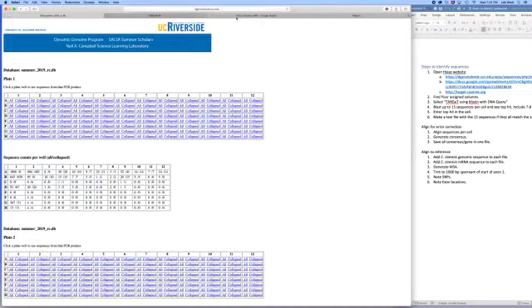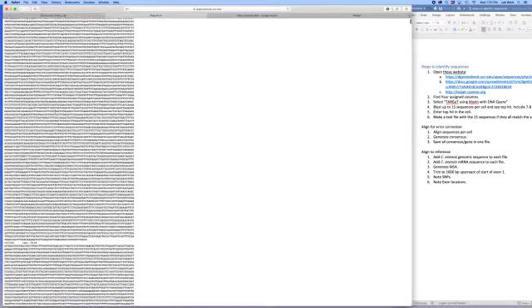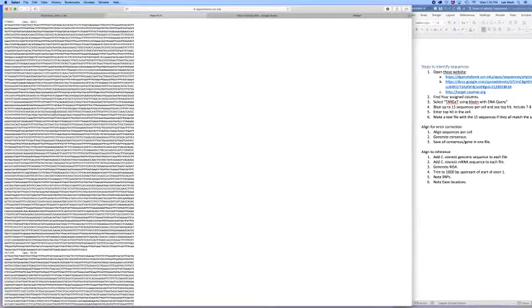But the problem is, I noticed as I was verifying my analysis, my cleaning up of the sequence, all the different scripts that I run the sequence through to get it so that it's usable, that when I searched on these sequences, so if I click this, I will get it in this tab here, when I put these in, it turned out it wasn't Lux. And then I blasted it against some other things, and I found that the sequence wasn't what it's supposed to be.